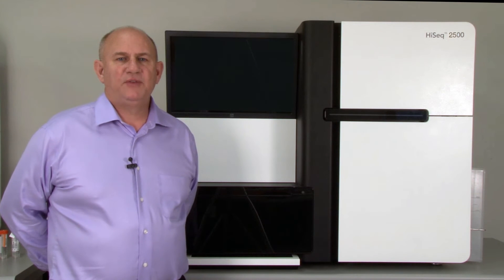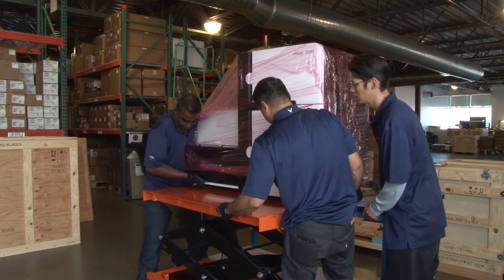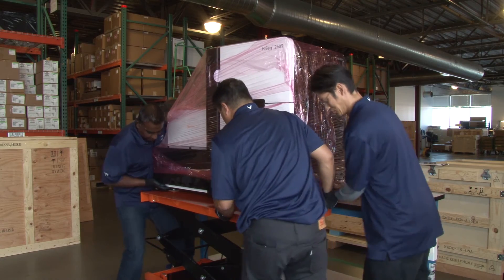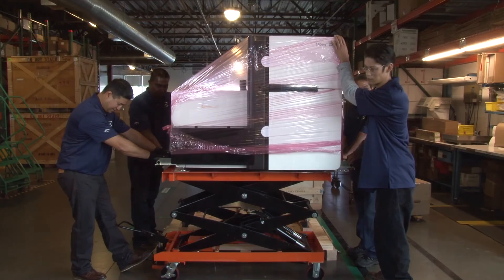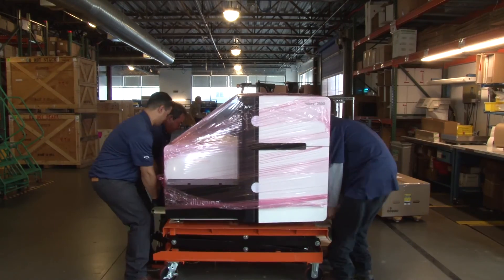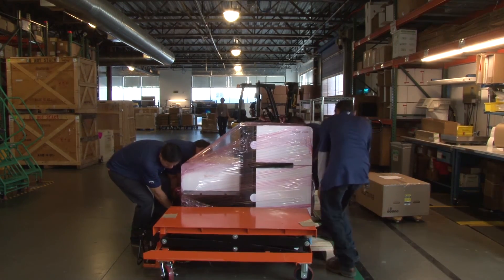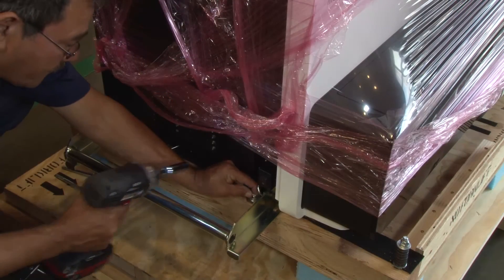In case the HiSeq instrument needs to be returned to Illumina or moved to another location, follow these recrating procedures to ensure safe delivery of the instrument to its destination. To begin recrating the instrument, raise the lift table to the height of the lab bench and with all four members of your white glove team, transfer the instrument from the lab bench to the lift table. Lower the lift table to the height of the crate and, using all four members of the white glove team, lift the instrument and place it on the crate base. Attach the instrument to the base of the crate using four bolts and tighten with a socket wrench.